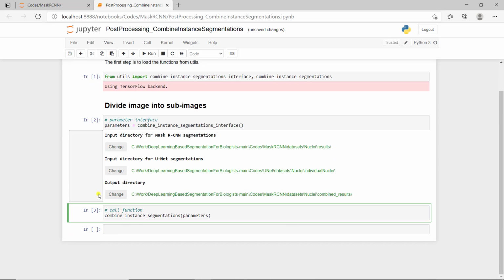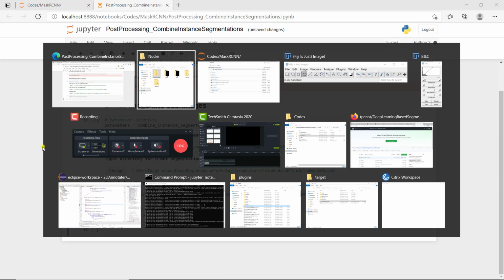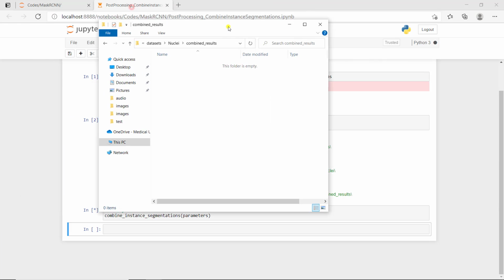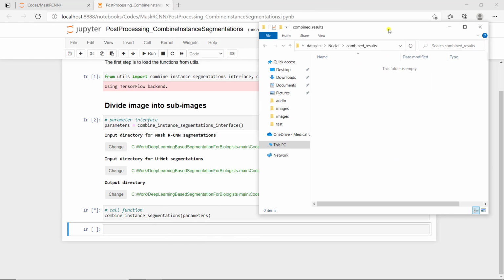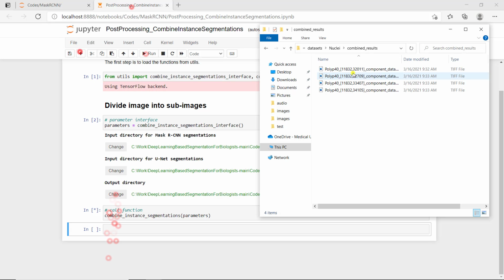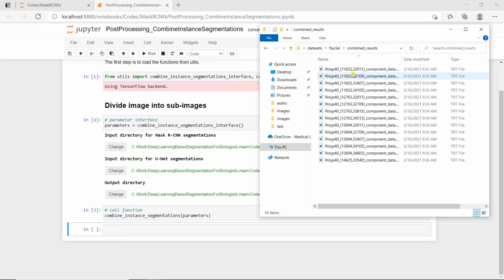Now I can just run the function. It's not very long. We can actually look at the pace here, but it takes a little bit of time. So again, I'm going to speed up the video so you don't have to wait for the entire processing. I'm just going to wait for the first image to process. You see how much time it takes to process an image. So now I'm going to speed up the video. All right, it's done. So let's have a look at the results.